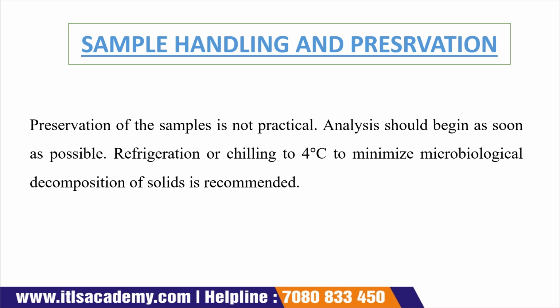Okay, but if we have to store that sample, then it should be stored at 4 degrees Celsius temperature, so that it will minimize the microbiological decomposition. Okay, now see what is written in the slide. Preservation of the sample is not practical.